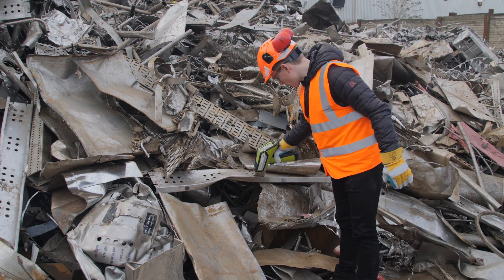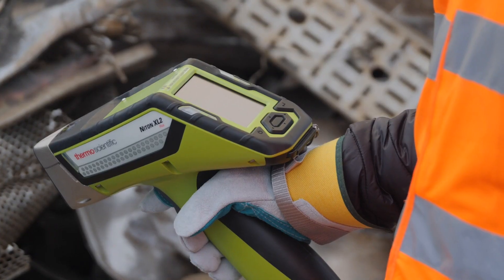The Niton analyzer enables us to analyze the material out on the yard much more instantaneously and keep our costs down within the laboratory.